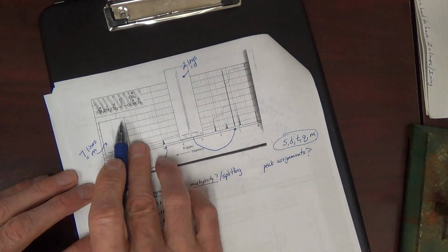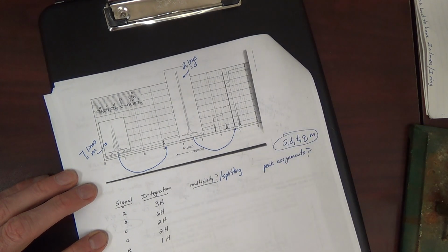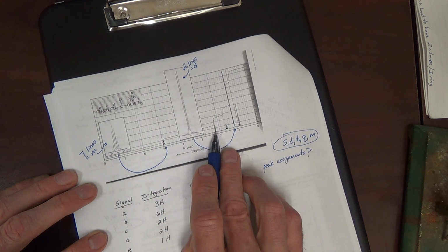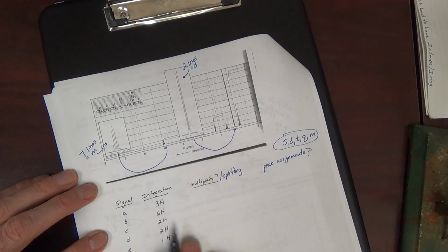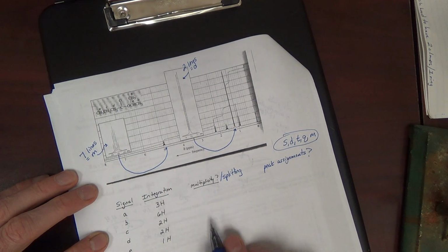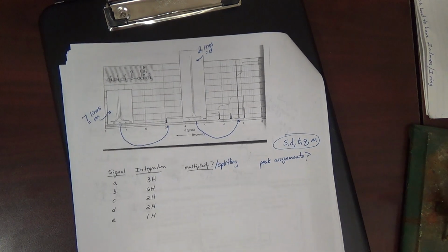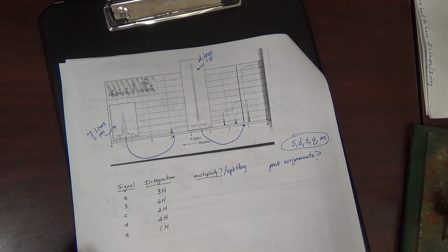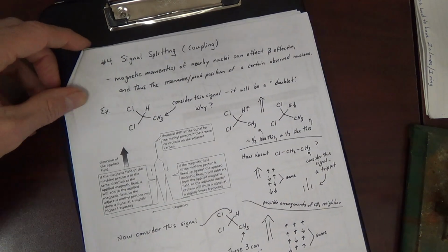We're really predicting peak position, and then we're just looking at what the multiplicity is. But practice on just looking at these peaks and telling if they're singlets, doublets, triplets, quartets, or whatnot. Try to do peak position and fill in the splitting that you see for each signal, and let's see how you do here. And then we'll move from there. That'll give us an introduction into splitting.